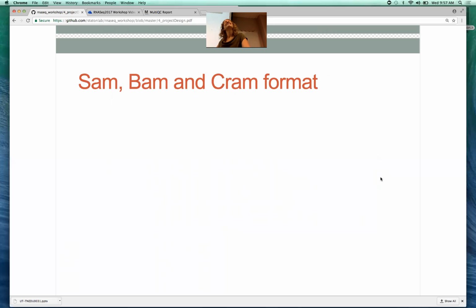Overly honest, yeah. I have a question about the number of reads. Yesterday you told us you prefer more than 10 million reads per sample, right? Does that 10 million mean R1 plus R2, forward and reverse sequencing? So reads are read pairs. So the total should be 20 million, right? It would be 20 million reads, 10 million read pairs.